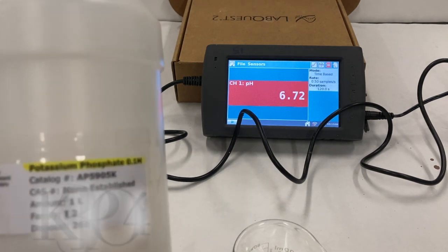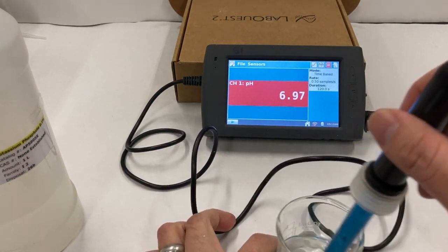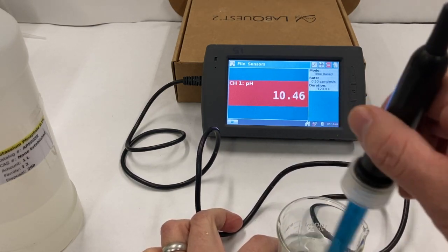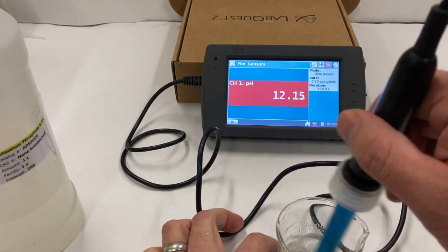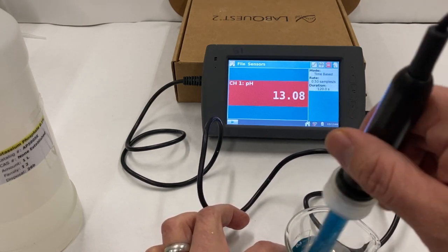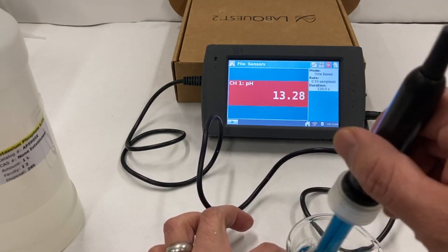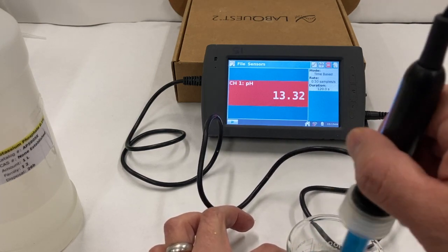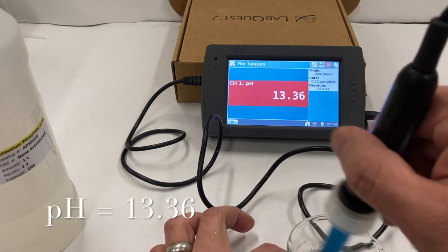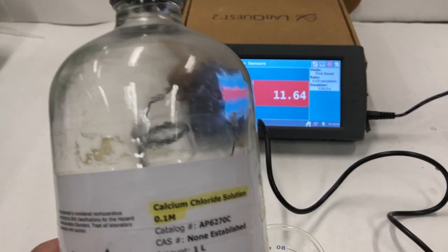Okay, next up, potassium phosphate. Ooh, this could be the winner. How high will it go? All right, we're going to call it 13.36. Next solution, calcium chloride.